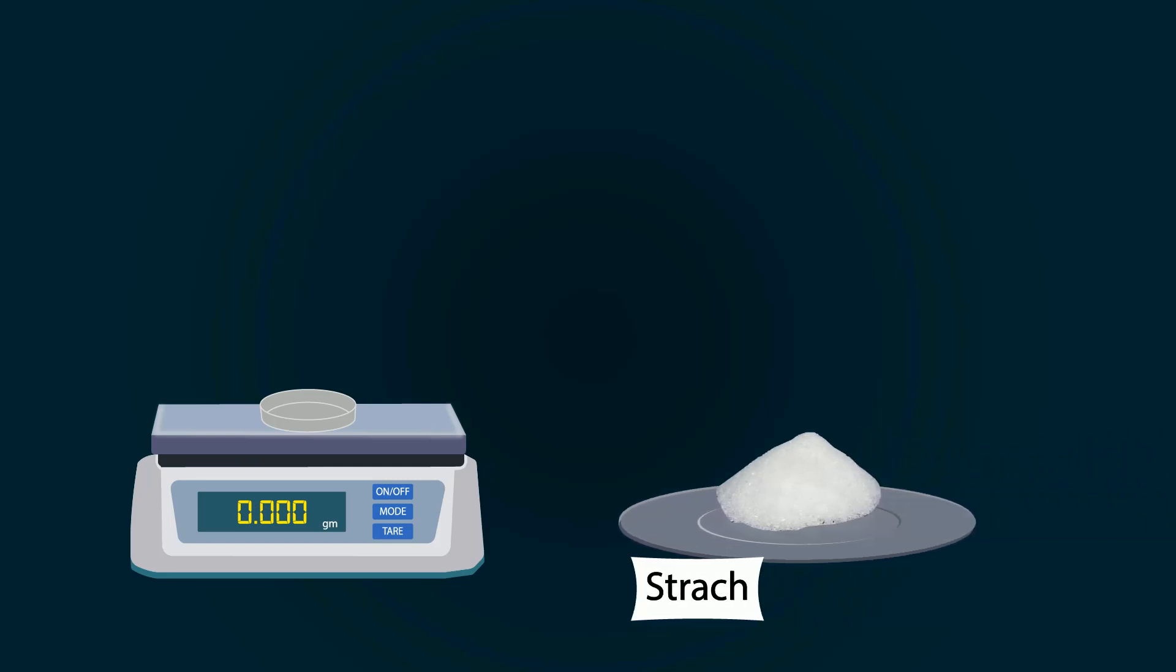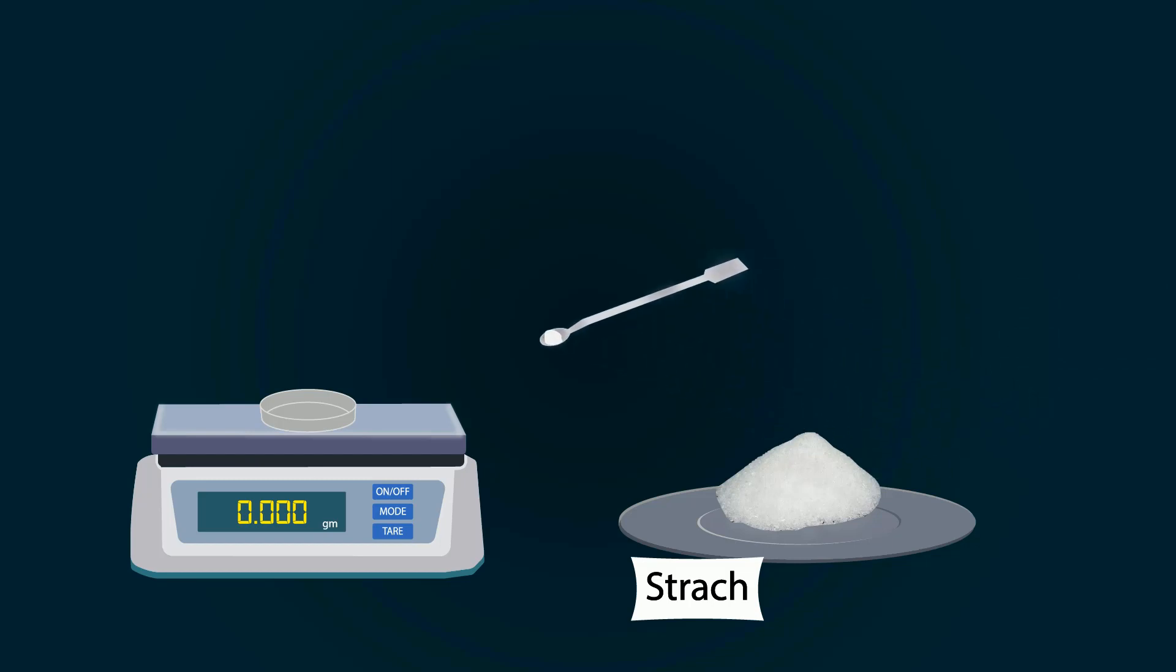Now take starch chemical from stock bottle. You can put starch into the petri dish with the help of spatula. Weigh precisely up to 1 gram.